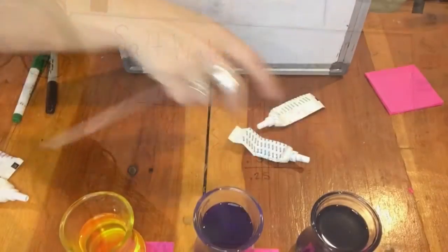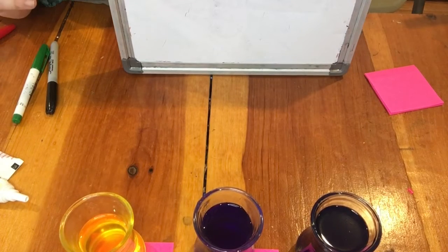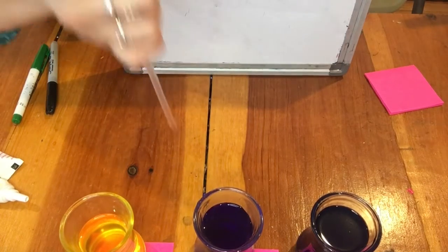And now we're going to build our density column. Using the calculations that you completed in part 1 of the lab assignment, you should have decided that solution 2 is your least dense solution. That's where we're going to start.